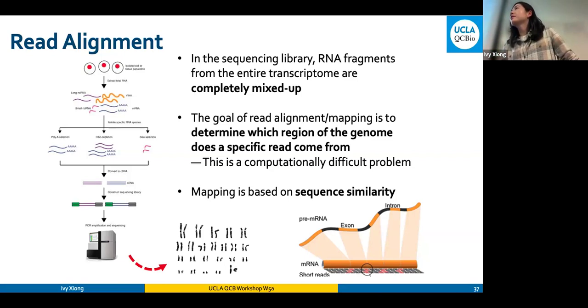So what happens to those sequences that, if they're too short, for example, could match in multiple regions, so they get thrown out, or? Right. So we actually make sure that the sequences are long enough in the filtering step yesterday. So that takes care of a lot of that concern. Base pairs, it should be fine. Yeah, usually, for 20, it's reasonable. But the sample yesterday was 75 base pairs for each read, right?